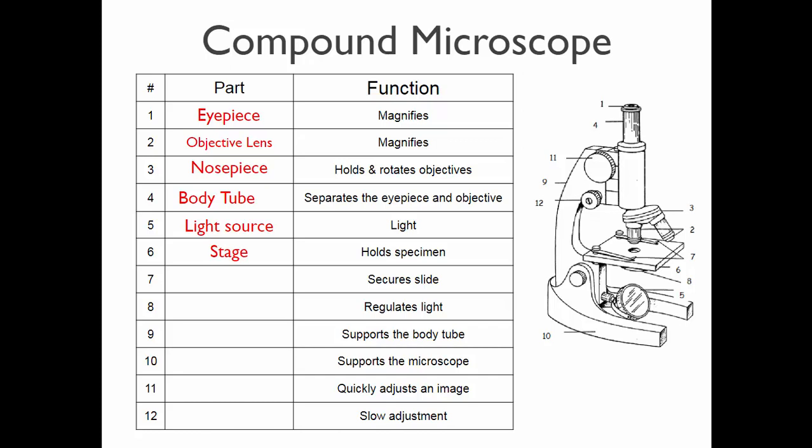The stage is the flat area where you actually put your specimen to be viewed. What we look at in the compound microscope are slides. Small pieces of glass that sometimes have some object mounted to it. It says the bee of a honeybee's leg mounted on it. We can also make our own slides using these blank glass slides and cover slips. So you put the slide on this flat part, the stage. You can secure it to the stage using these metal clips. They're called stage clips. Underneath the stage, there's a little lever you can move. And it's hard for you probably to see. You'll be able to do this tomorrow probably. This adjusts. Do you see what it's adjusting? The light. Yeah, the amount of light shining through the stage. It's called the diaphragm. Isn't the diaphragm in your body? Yeah, it's a different thing, but yeah.